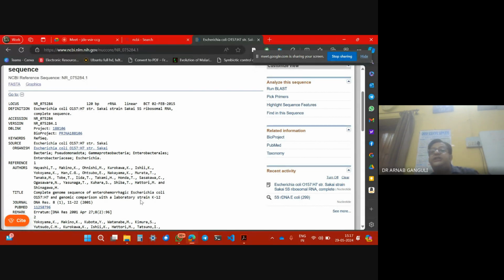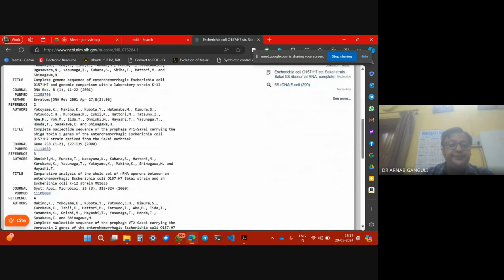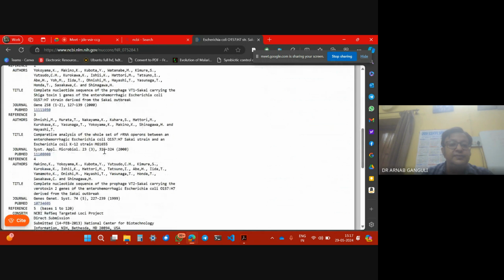So this is not a good strain to have in your E. coli. There are harmless strains. So this is a very pathogenic strain. Clinically, it's a very significant strain. Therefore, this came out first. So they have done it, strain K12. Which journal? You can find this original paper if you search. Authors are there. And there are many other details about authors where you can find everything.